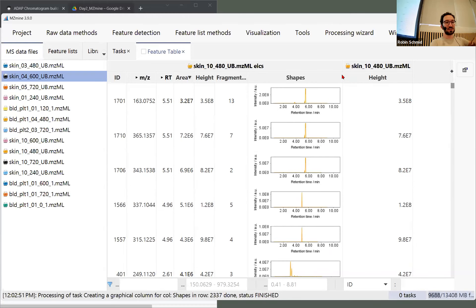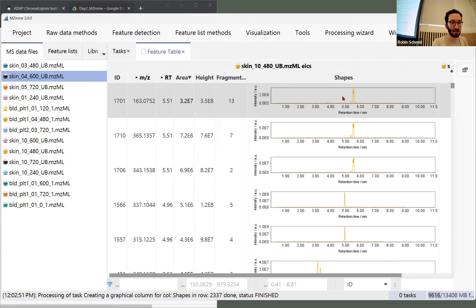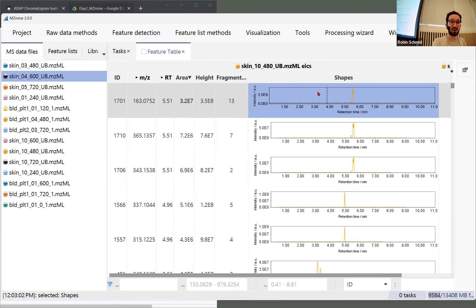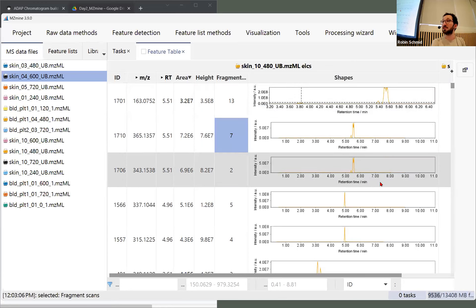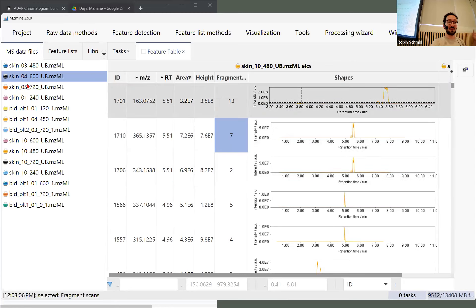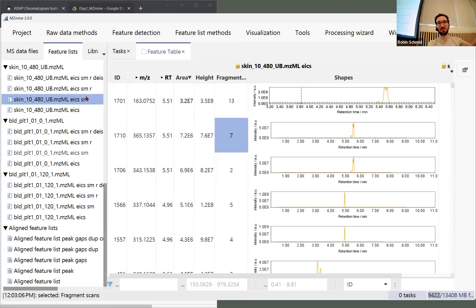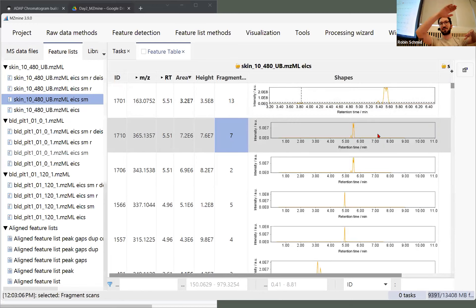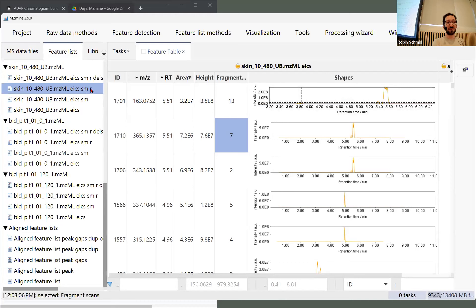For the chromatograms, I can look at the area — if I sort by descending area, we can see all the shapes. I can increase that, it takes a bit of time, and then we have all the chromatograms. I can click in the charts and zoom in to look at the shapes. We can already see that some extracted ion chromatograms now show multiple peaks that we need to separate — that is what we do with smoothing, to get rid of fluctuations, and then also with resolving.